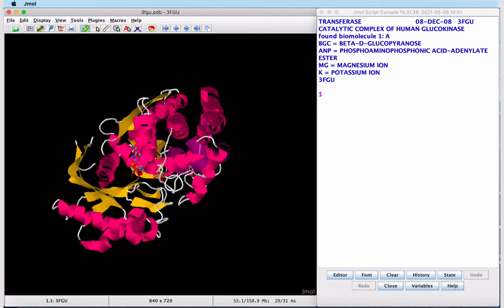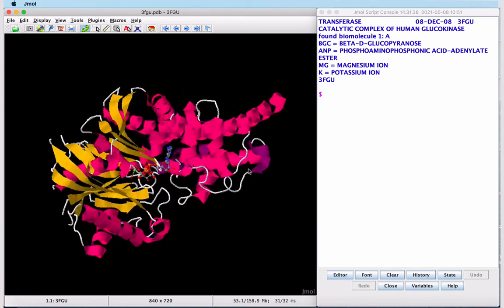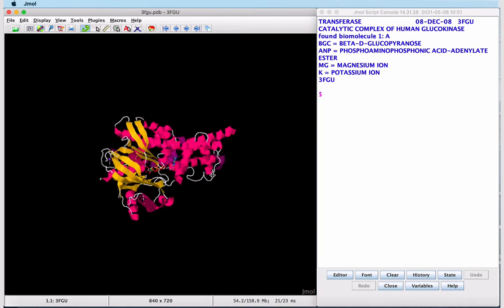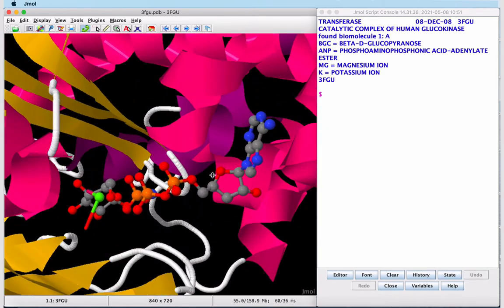By rotating and zooming in on our structure, we can mouse over the three active site ligands and see their identities.